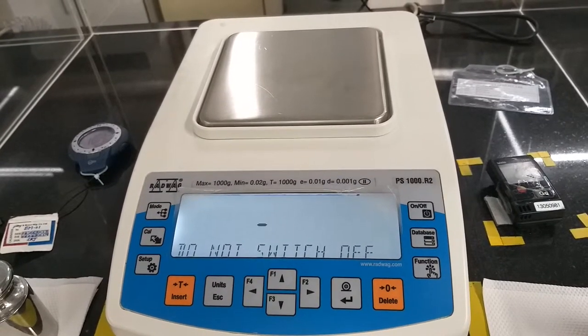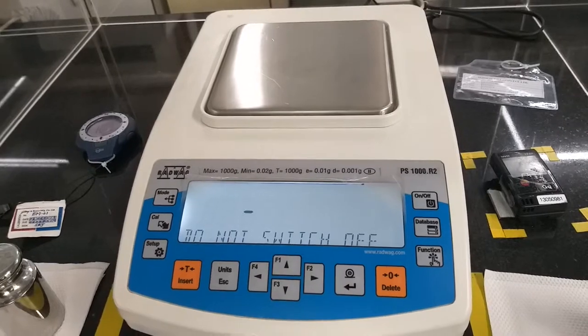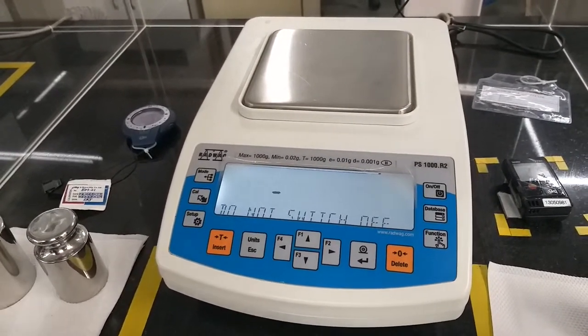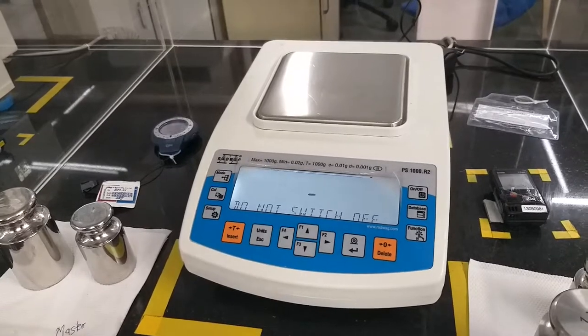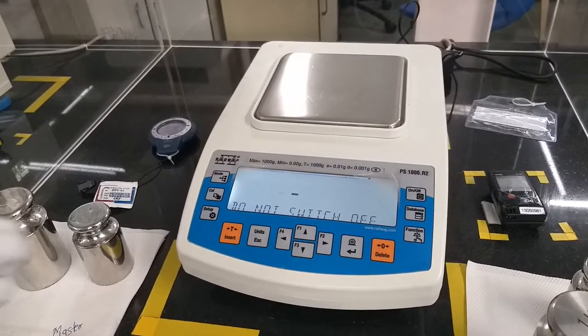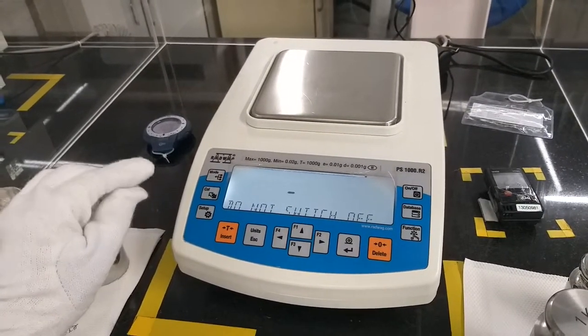The substitution method for weights which we are going to use is ABBA, where A is the master and B is the UUC. So ABBA means master, UUC, UUC, and then master again. After the internal calibration procedure gets over, we will start calibration.